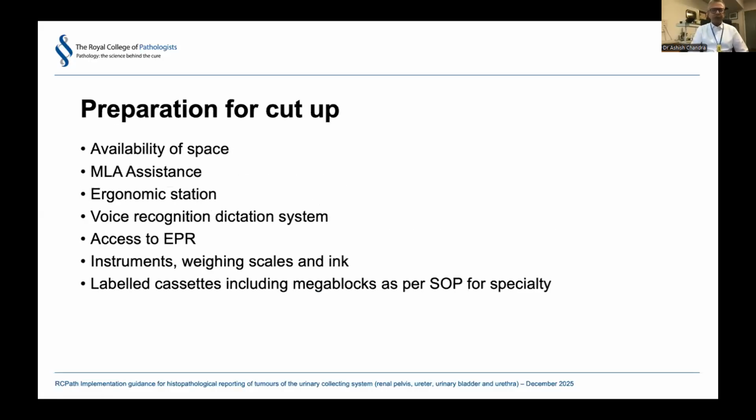So the preparation for cut-up, of course, is pretty much the same as any other day. We're just drawing attention to the two main points here, which is, of course, the use of the voice recognition dictation system, but you could also use the RCPath proformas for entering your information. And then, of course, access to EPR on that system is really helpful because we encourage you to look up any previous medical details and histological and radiological details at the time of cut-up so that you have all the information you need for appropriate sampling.